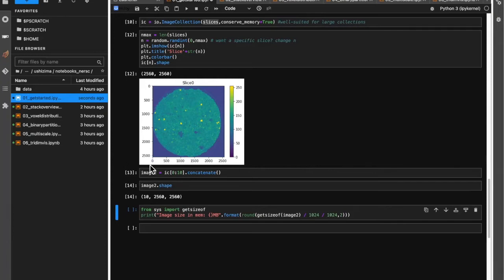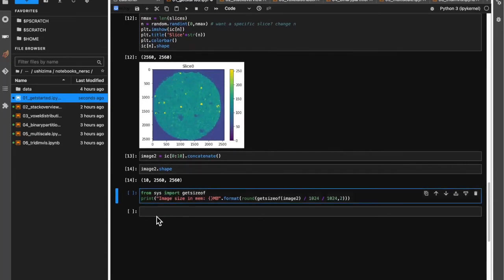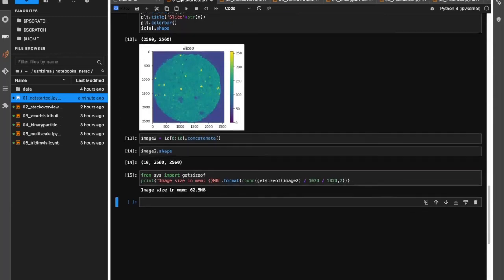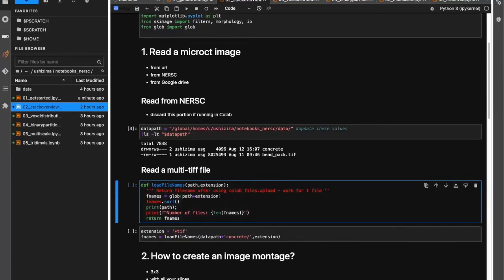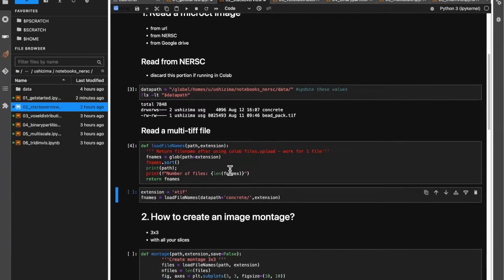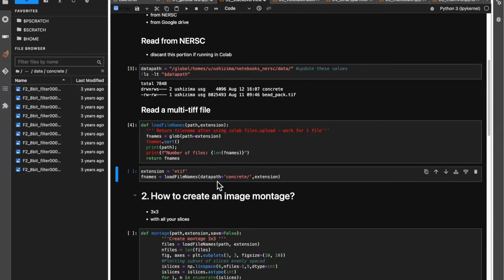Now double check that is the case: each slice is 2560 by 2560, and 10 slices in terms of the height. And in case you want to do that — probably something you'd want to do first — is to calculate how much memory this set of slices requires. So that's the result. Instead of loose calls, I'm creating a function called load_file_names. Every time I need to read a collection of files that is currently in data/concrete, that's what I'm going to use. All of them use this extension — it might be the case that your data uses TIFF with double F. So that's how you change the code to make that work.